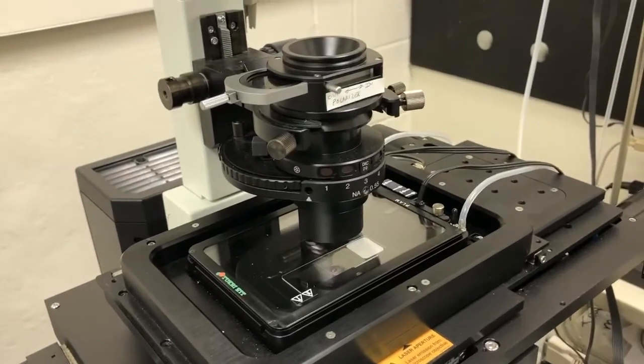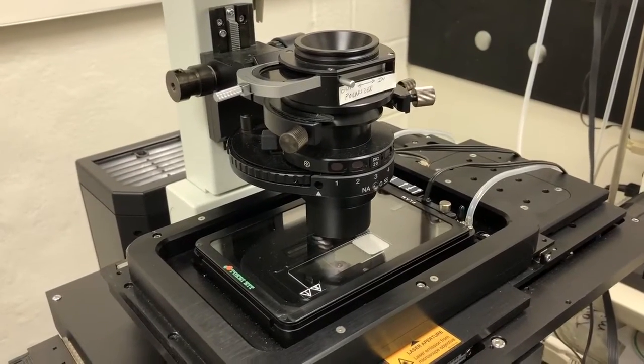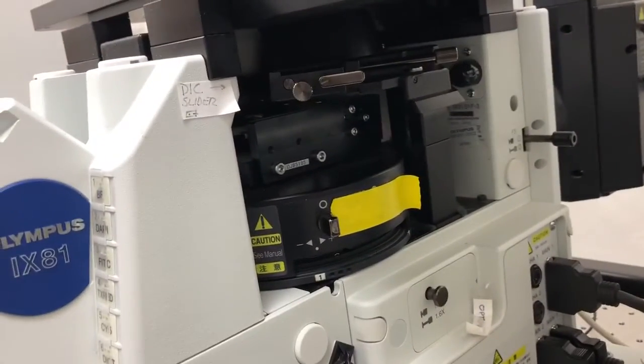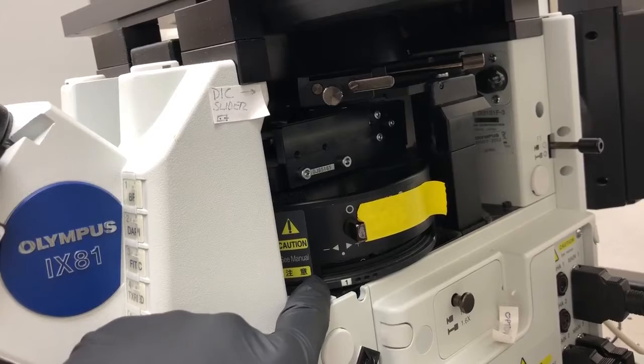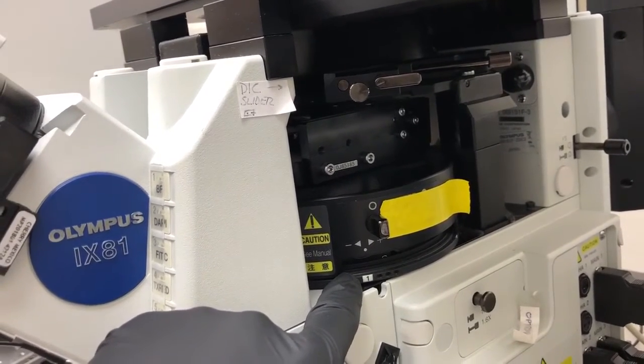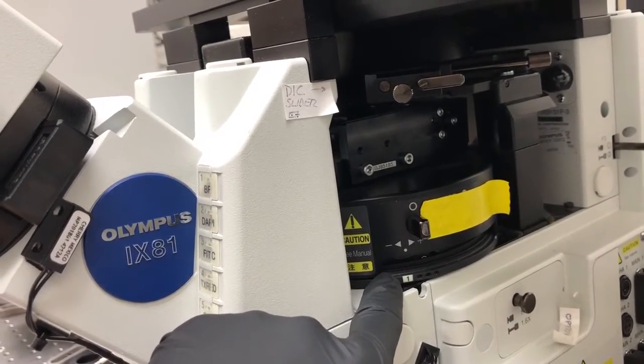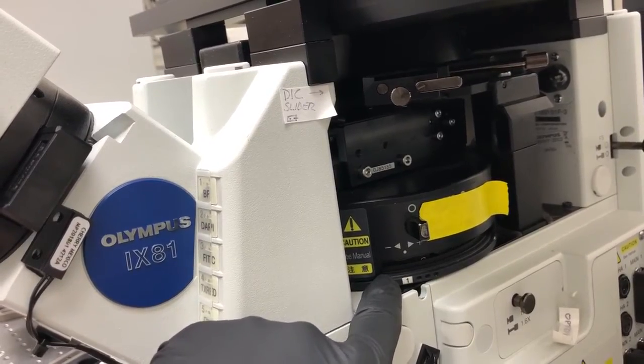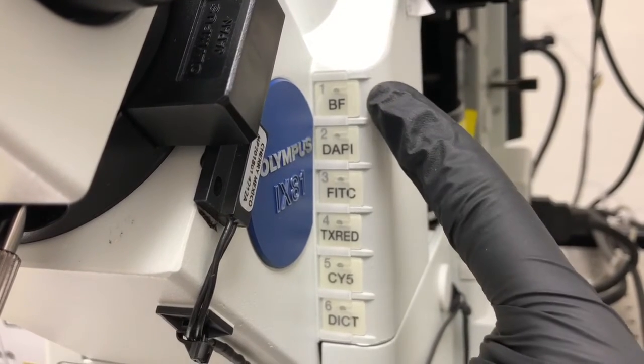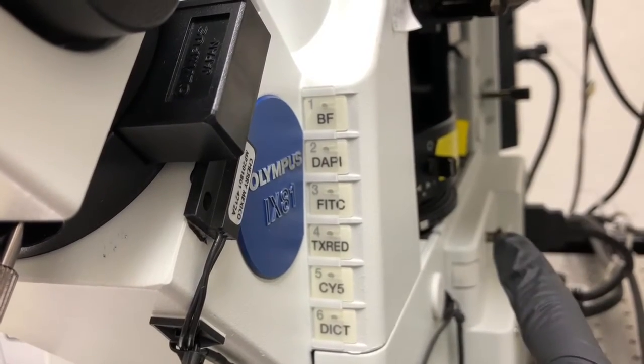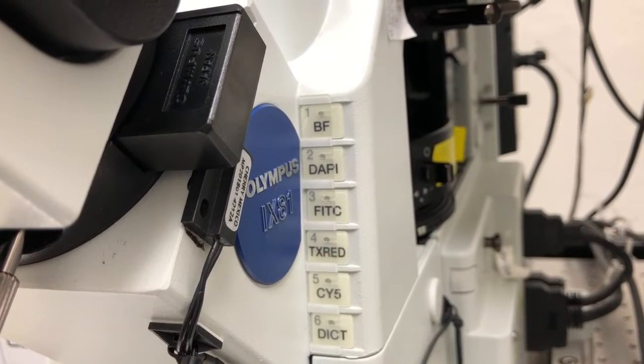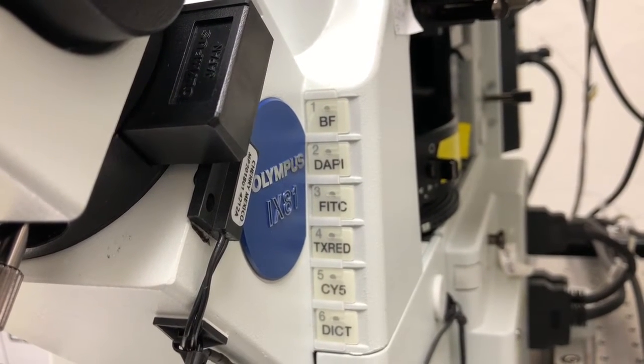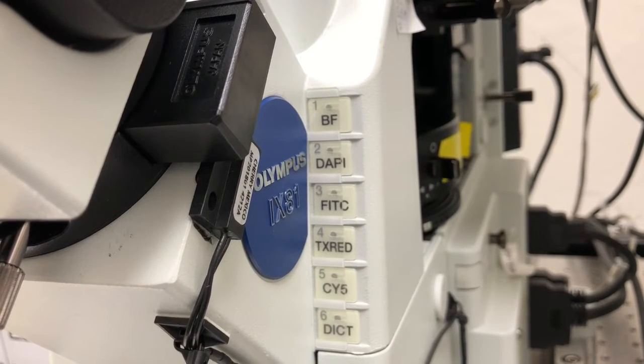But how do we make sure that light makes it through to the eyepieces? So the first thing we need to pay attention to is the position of this turret. This turret contains filter cubes that are used for different scenarios, which are outlined here on the side of the microscope. In position one of that filter turret, we can look at brightfield. In positions two, three, four, and five, we can look at different fluorophores by eye.